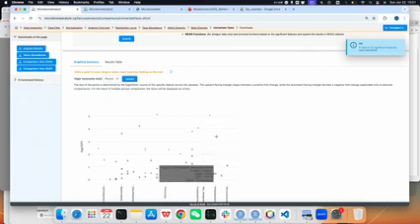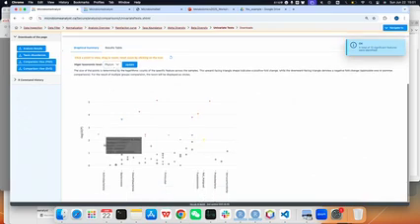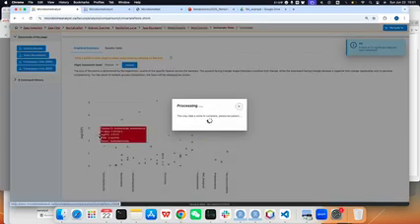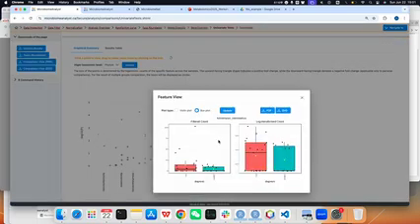Here, the different colors show the higher taxonomy level. Here we use the phylum, so each color shows a specific phylum, and then the dots show the species that are significantly differential. So you can click to see the box plot.